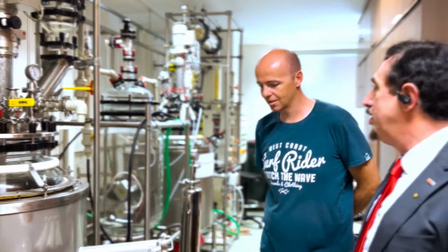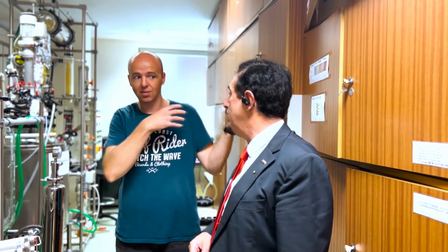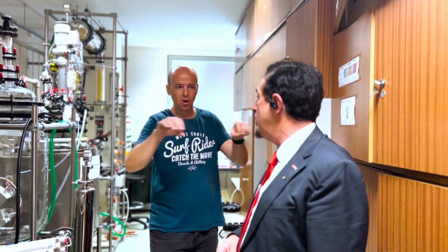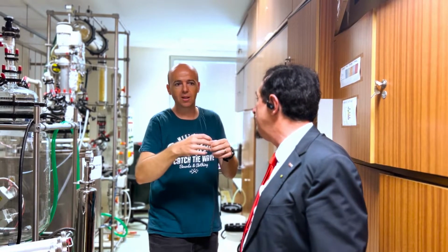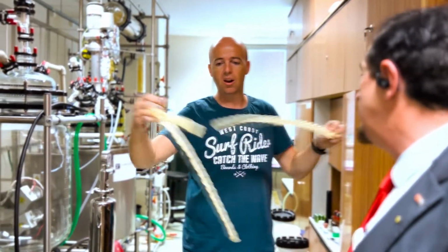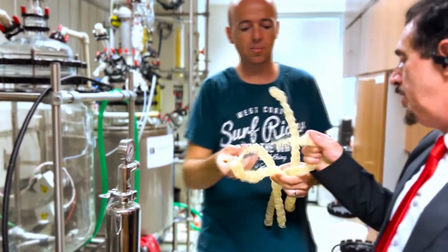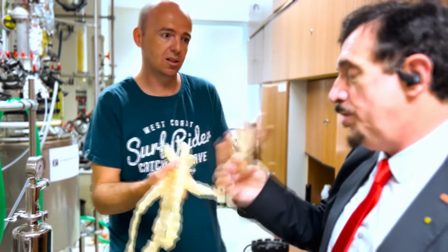Yes, of course. Sometimes it's necessary to modify, because in the small laboratory amount, in case of our fertilizer, there are problems because of the casings. As you see, the small casings stick together. However, if we take it, it has a lot of meat. And during the process, what is the material, by the way? It's pure collagen. Collagen, connected together.